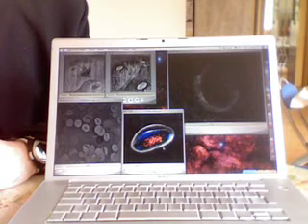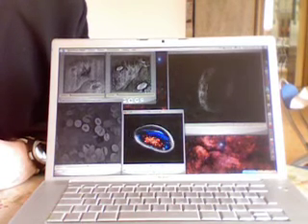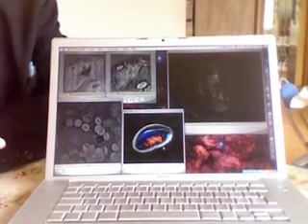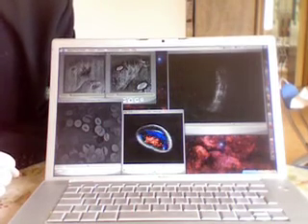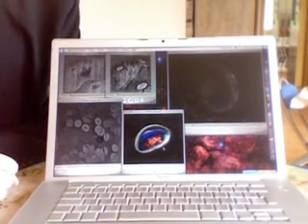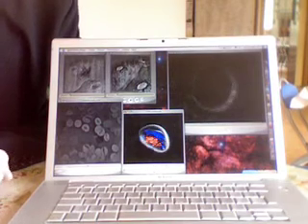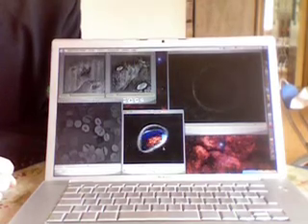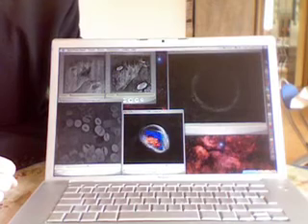It's an interesting microscope. And if you do some collaboration with other researchers, what kind of things can you offer to them? Now we master this technique of tomographic diffractive microscopy, so we are able to observe transparent specimens, and we believe this may be of interest for biologists in particular, because we now have access to another physical quantity which up to now is not used by biologists.